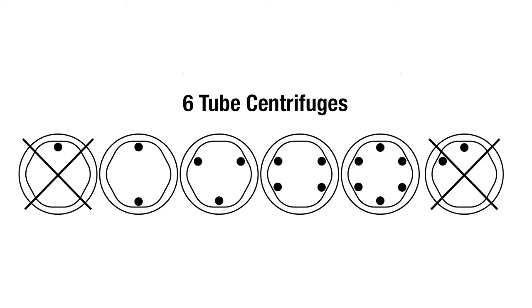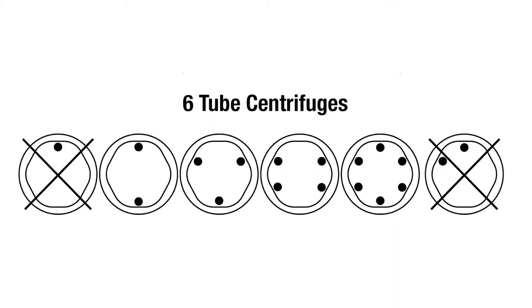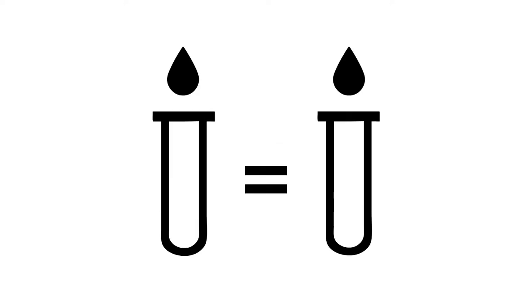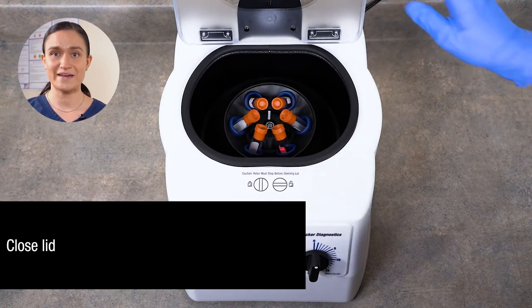Step 2: Load your samples. When loading your samples, opposing tube holders must be of equal weight, as shown in the diagram on your screen. So if we're loading two tubes, just put them across from each other. If it's three, make a triangle. Four, a square, and so on. If you're spinning an odd number of tubes, you'll need a counterbalance tube. This should be an identical tube filled with an equivalent volume of water from the tube across from it. The counterbalance should be roughly the same weight as your filled tube. With your tube holders in place and your samples loaded and balanced, you're ready to spin.